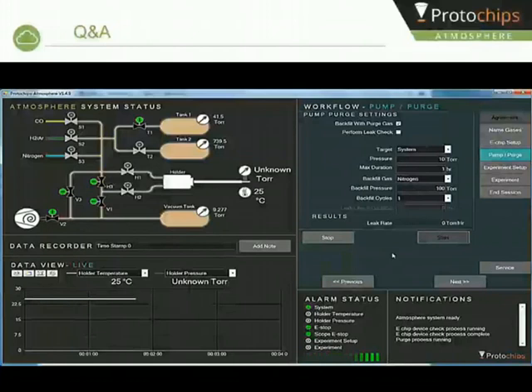This one definitely is a question for Larry, and it concerns the imaging of atomic resolution of the particles. Imaging the particles at high resolution through two SiN membranes and a small volume of gas at high pressure, does this require significantly more electron intensity compared to regular TEM grid-based imaging at UHV? No, it doesn't. All of the resolution happens with the electron beam just passing through the 30 nanometer thick silicon nitride top window, or top heater membrane, and then onto the sample. The sample is right under that membrane. After that, it's just scattered electrons, and electrons scatter down through the gas, through the bottom window, and into the detectors. All the gas and the bottom window add is a little bit of noise. So we don't use any special conditions.